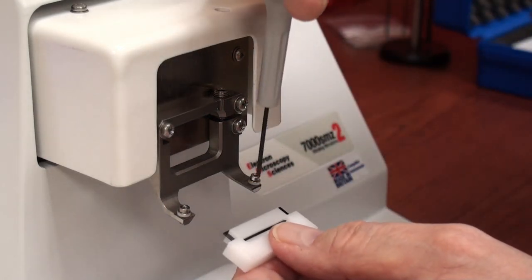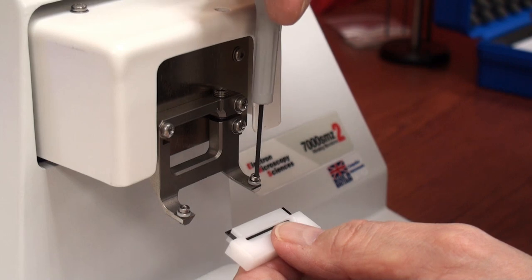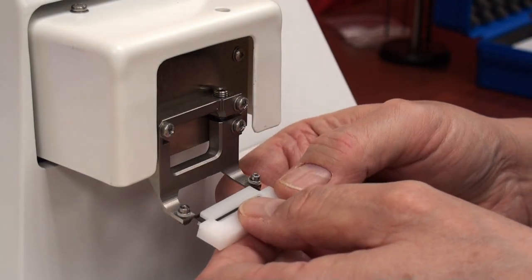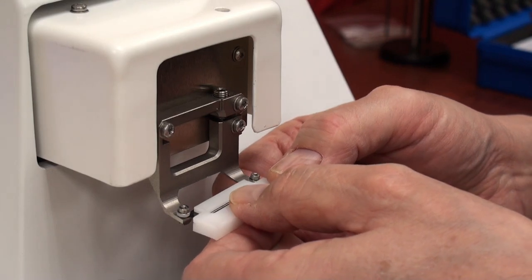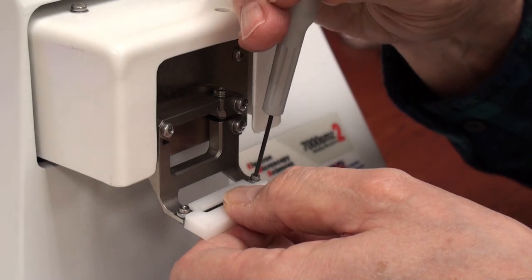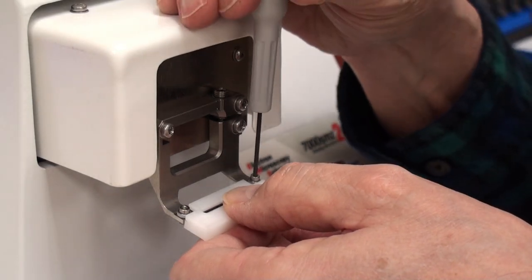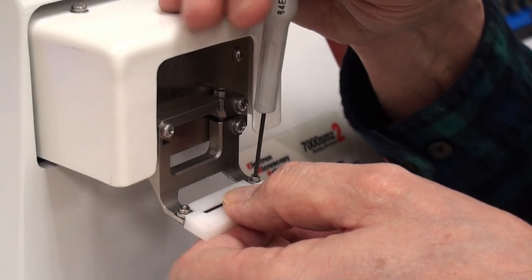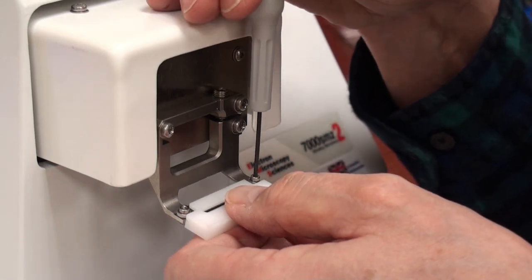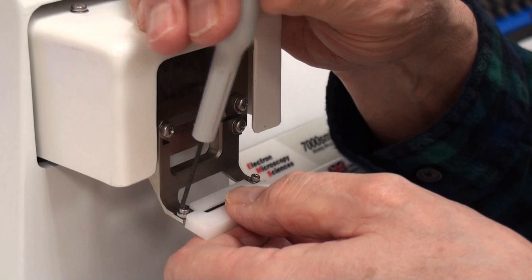If you don't have these loosened enough, it's a little bit more difficult. There is a cutout on the knife holder. Once it's in place and it's butted up against the rear of the knife holder, you can tighten it down.